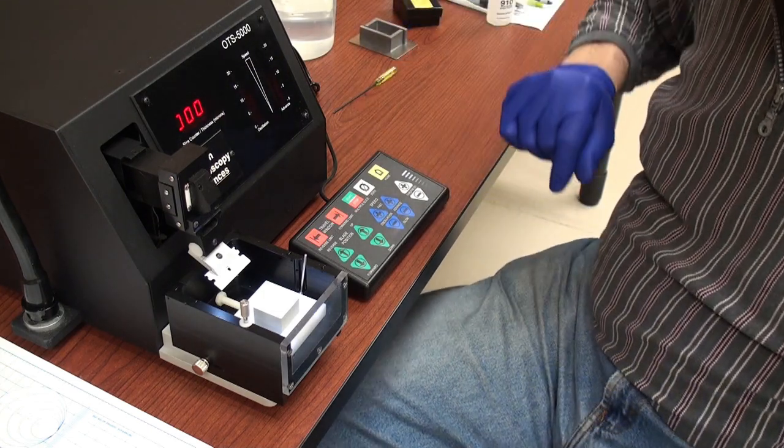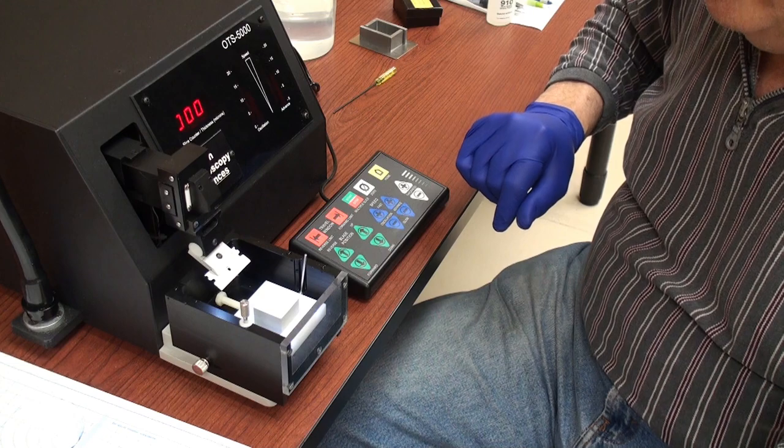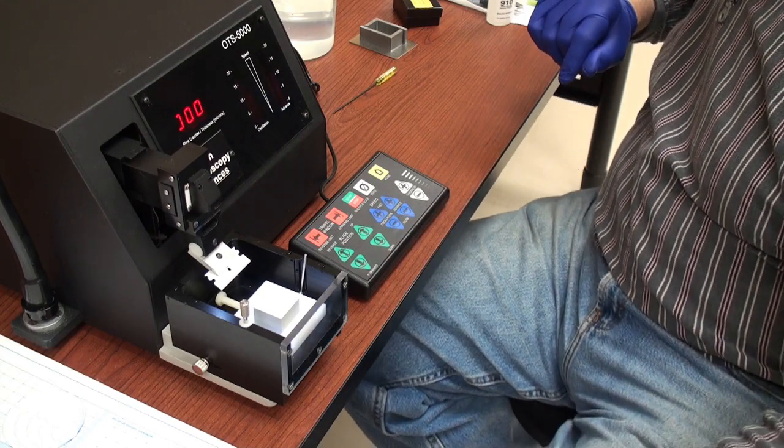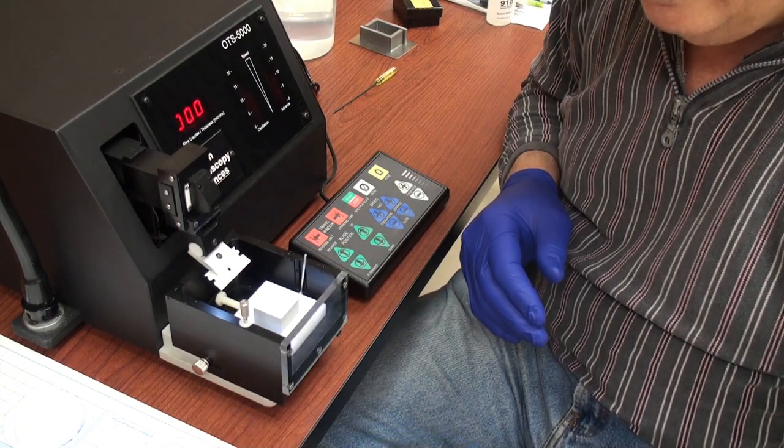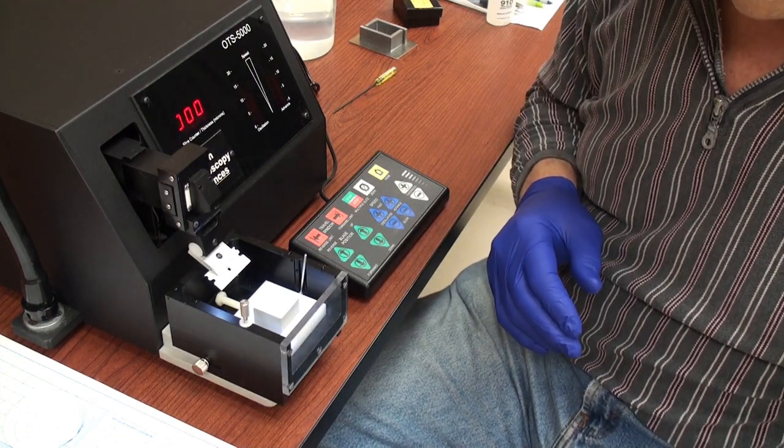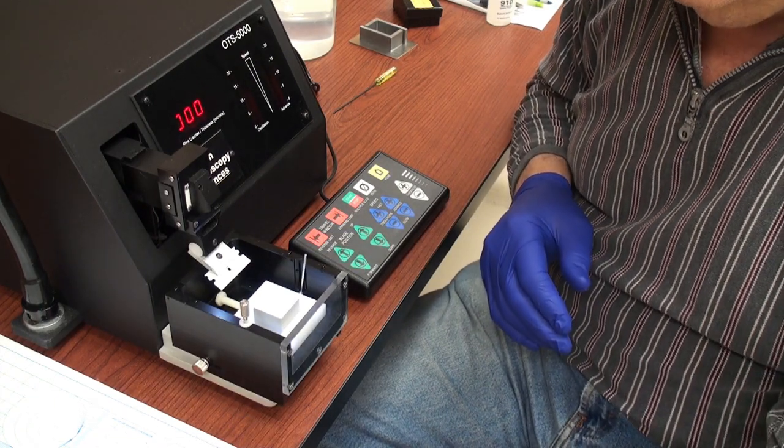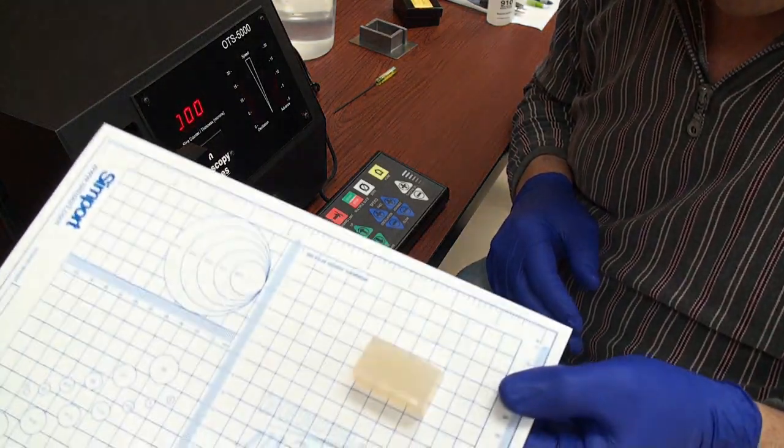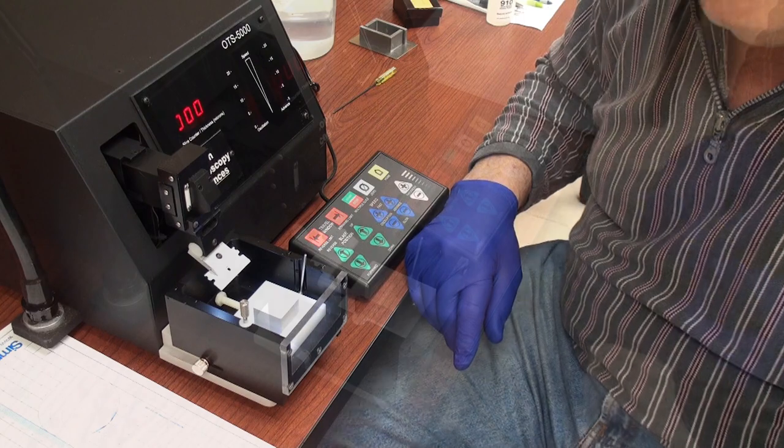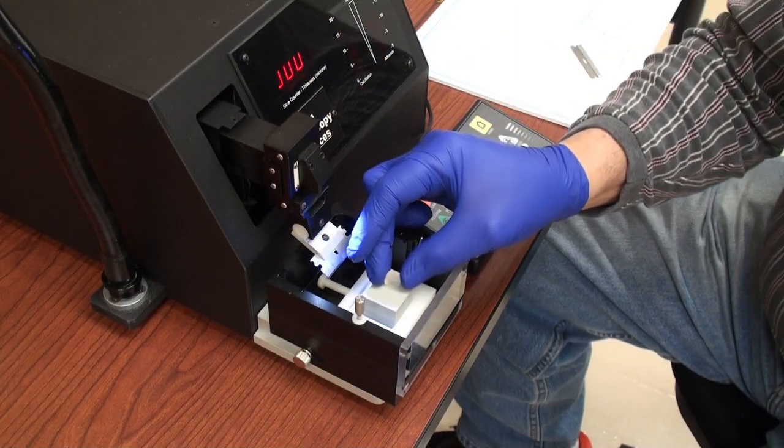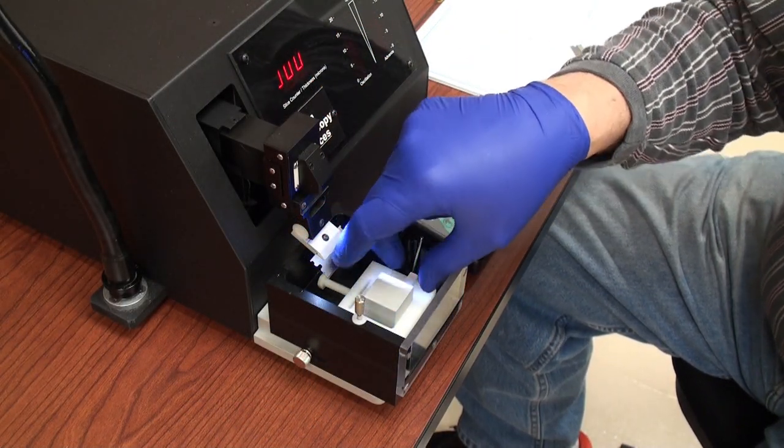Just set that aside. Now I am just going to use a regular razor blade to trim this agar block down to size so I can put it on the stage. Ok, now I have trimmed down a small piece of agar.